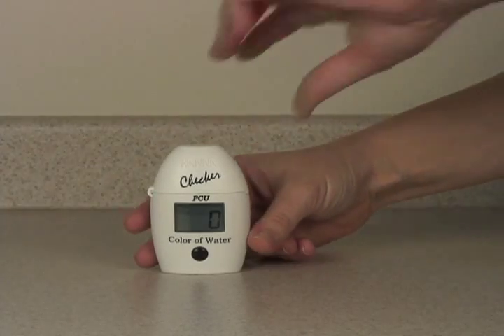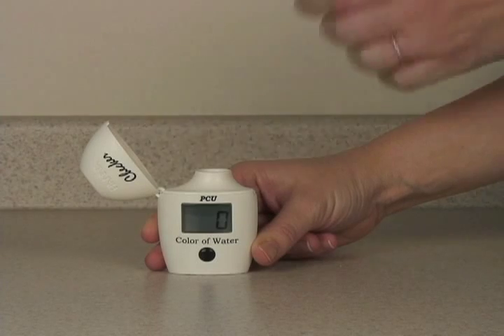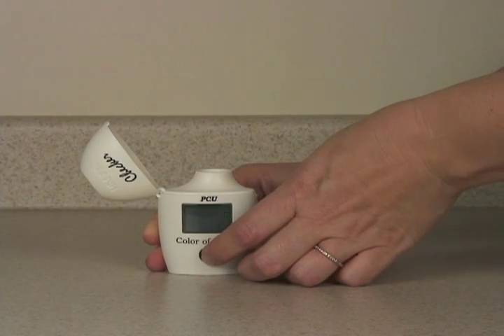Record this value, remove your apparent color sample, and press the button twice to restart the meter.